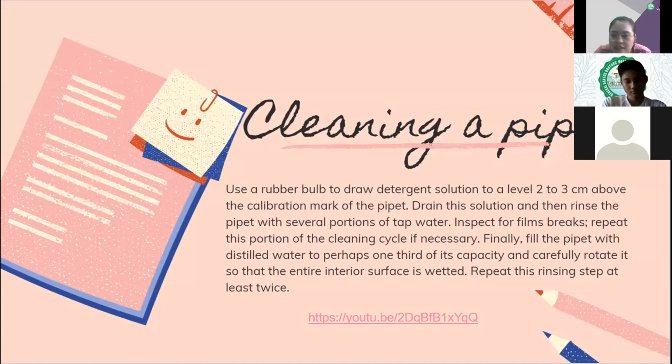So you can again use distilled water in cleaning the pipette. You can roll the pipette so that all the walls inside will be thoroughly clean. Okay, so actually we don't really use detergent in cleaning our pipette. Most of the time, it's just distilled water. And then after thoroughly cleaning it with distilled water, yung wala ng breaks, pwede na natin siyang lagyan ng solution na i-measure natin, pero ipara-run through lang natin so that all the walls inside will be coated also. So before talaga tayo mag-measure.